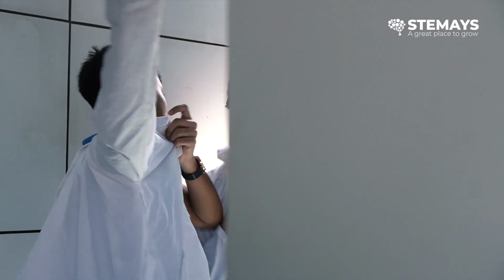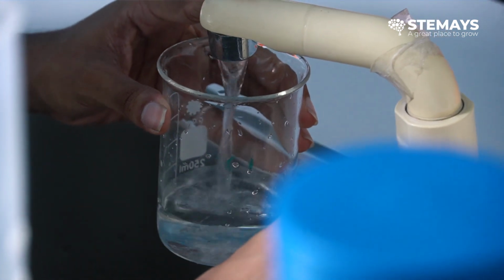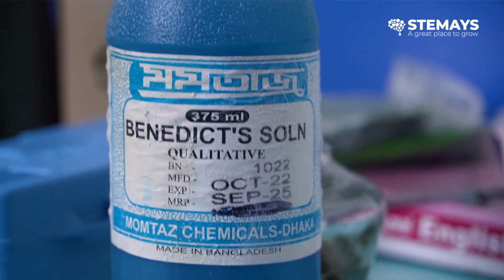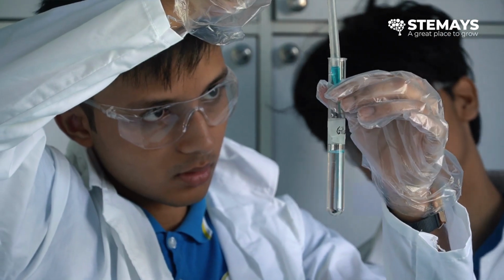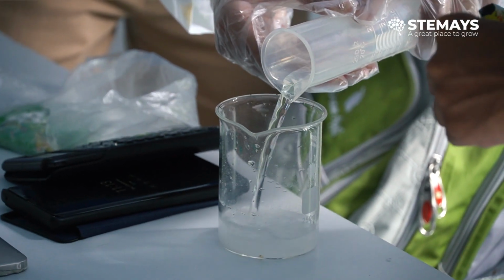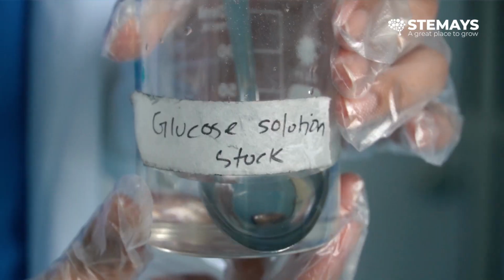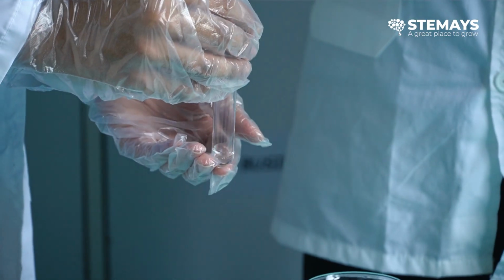At the beginning of the class, we had to follow some safety precautions like wearing aprons, gloves, and goggles for our safety. After that, we filled up a beaker with tap water and put some Benedict's solution into a test tube. The Benedict's solution was blue in color. Then we put glucose, a sugar, into the beaker and mixed it until it was fully mixed. And then we put Benedict's solution into the glucose solution, and then we put it into a test tube.